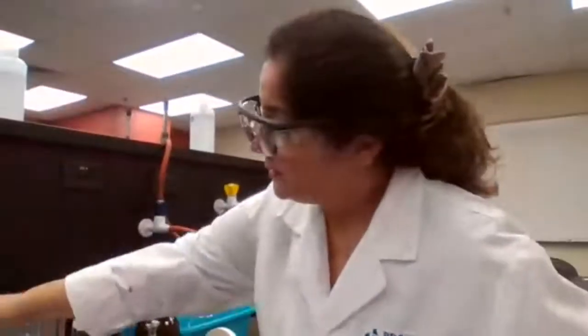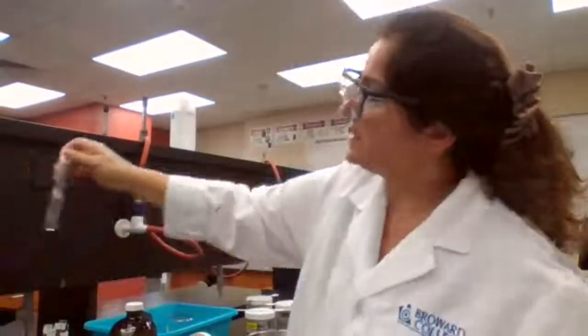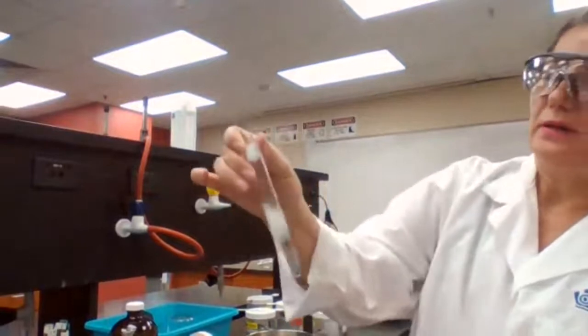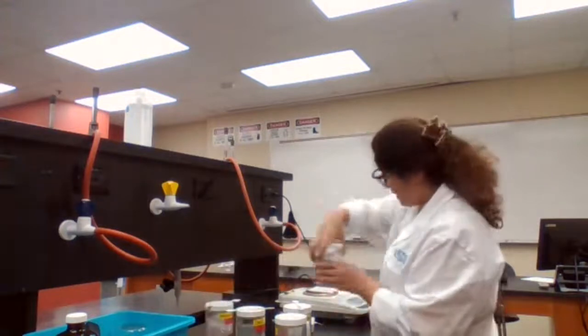Okay. For part C of the experiment, we are going to check the surface area while I'm waiting for these reactions to happen. Because it's taking time, I will be monitoring the time, but it's a slow reaction. I can do some work ahead of time for the other experiment. So I need 0.5 grams measured, so I'm getting ready for the next part of the experiment. About 0.5.